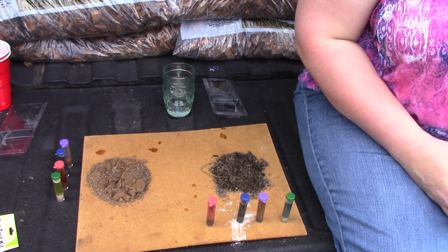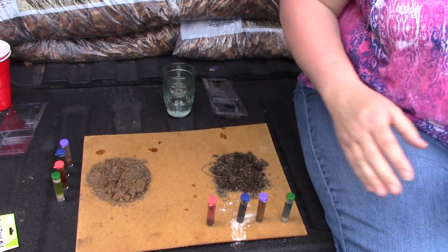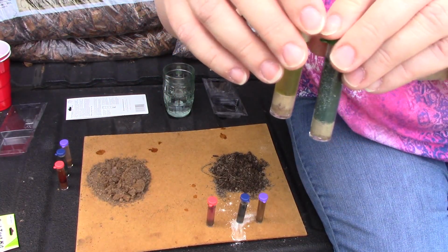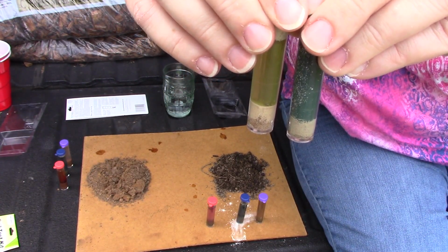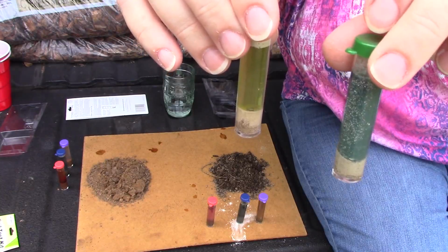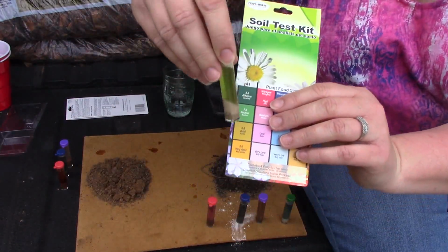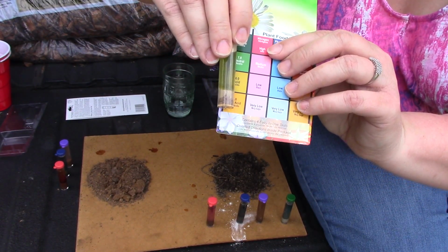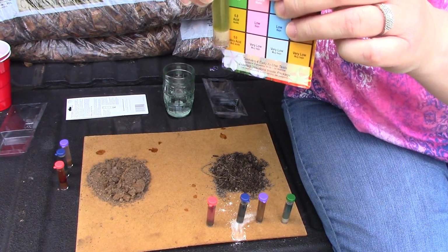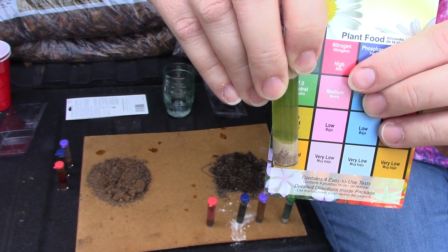Okay, so it has been 10 minutes since we have done the other ones, and we have both of the ones here. And I'm going to show you the difference between the amended and the non-amended. This is the amended, and this is non-amended. The alkaline is too high for the amended. The non-amended, the alkaline is between neutral and acid? I don't know. What do you think? Yeah. It's between neutral and acid. So it would be actually okay.